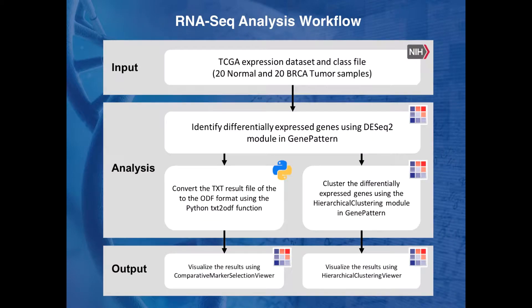To demonstrate, we'll create a new notebook which will walk us through an example differential expression workflow for RNA-seq data. For this example, we will be using 20 breast cancer primary tumors and 20 normal samples from the Cancer Genome Atlas Data Portal, or TCGA, which were previously passed through a data prep workflow for RNA-seq data.